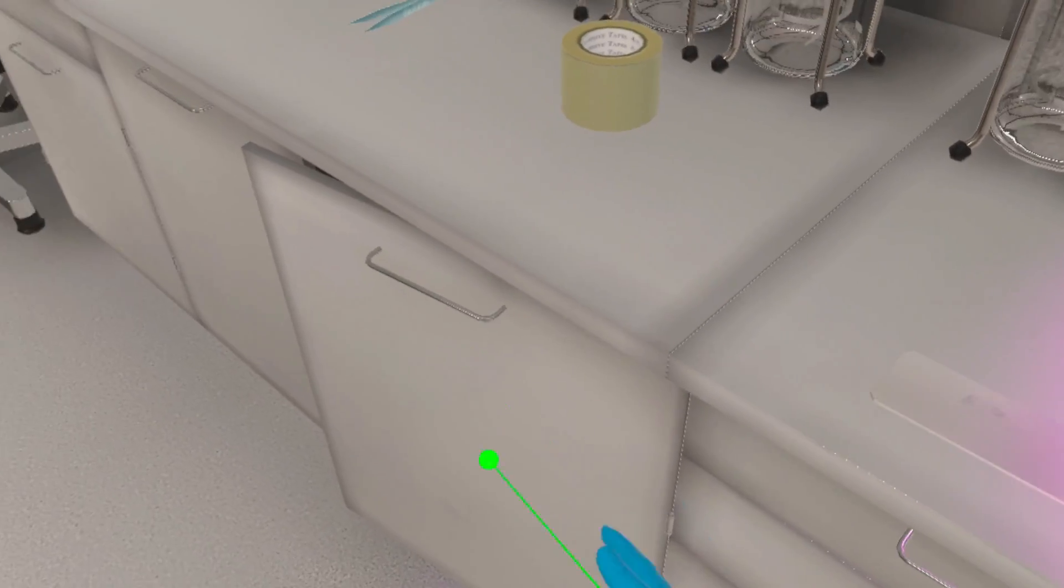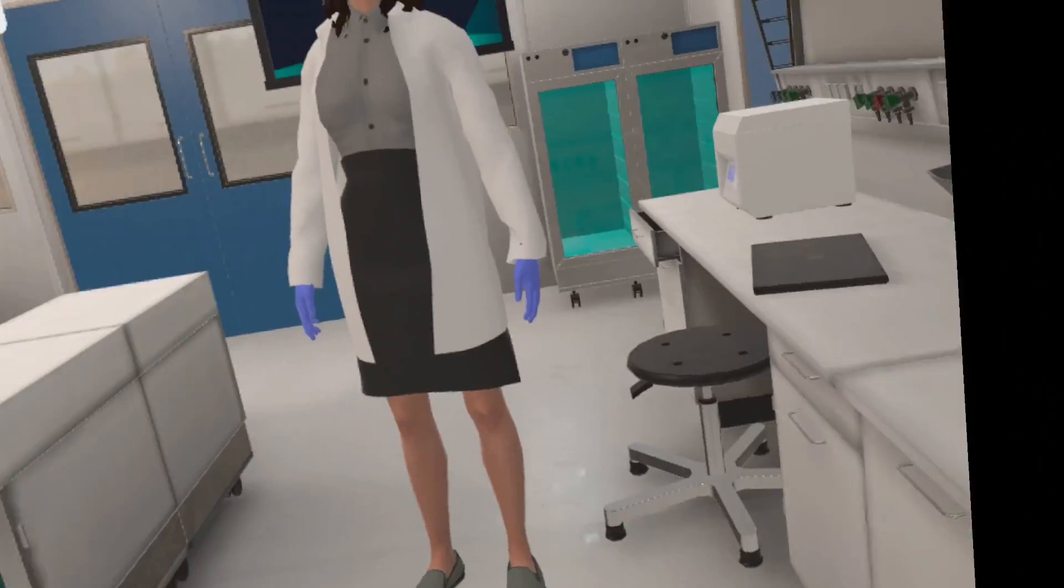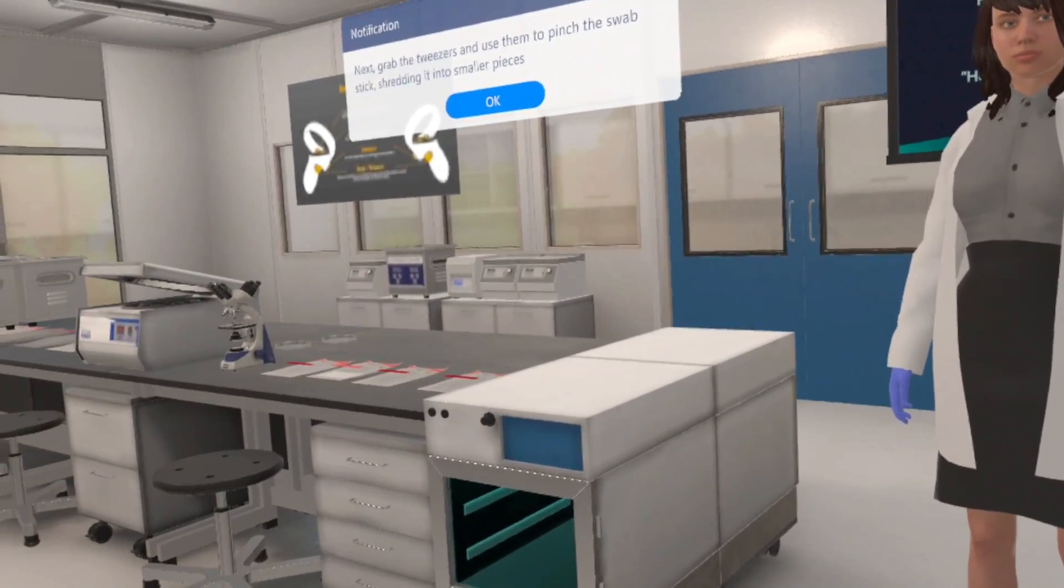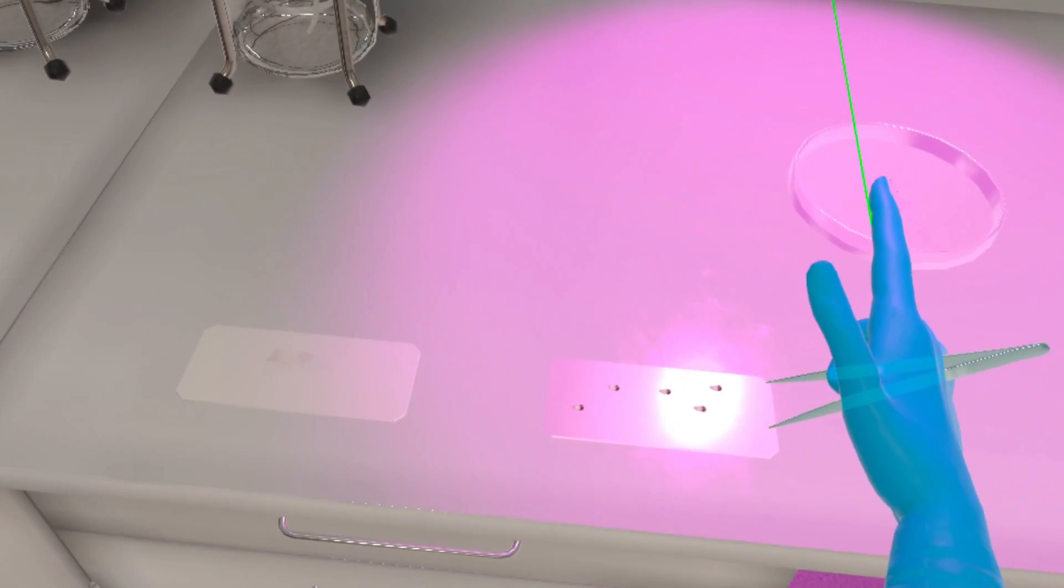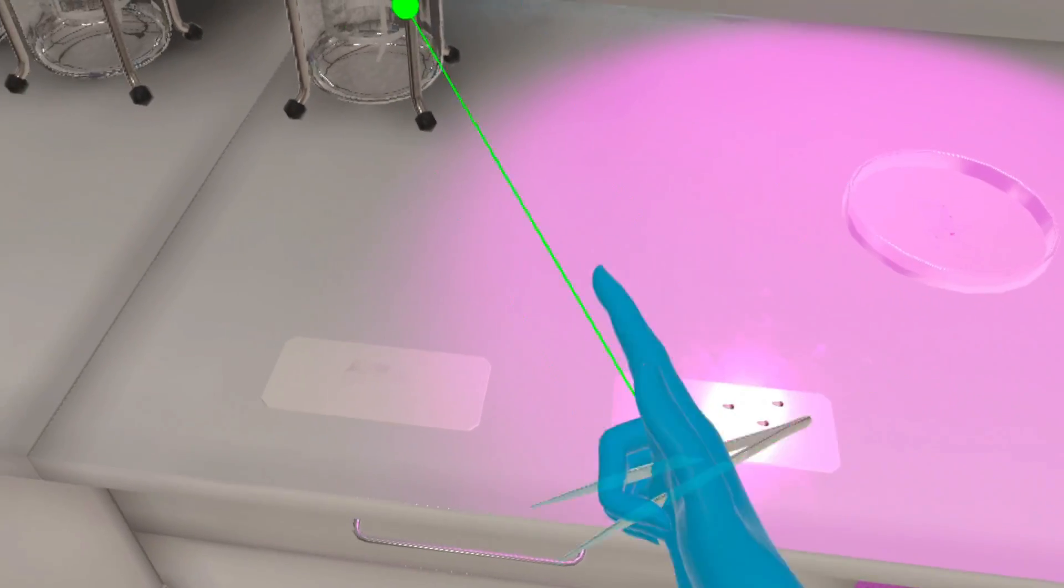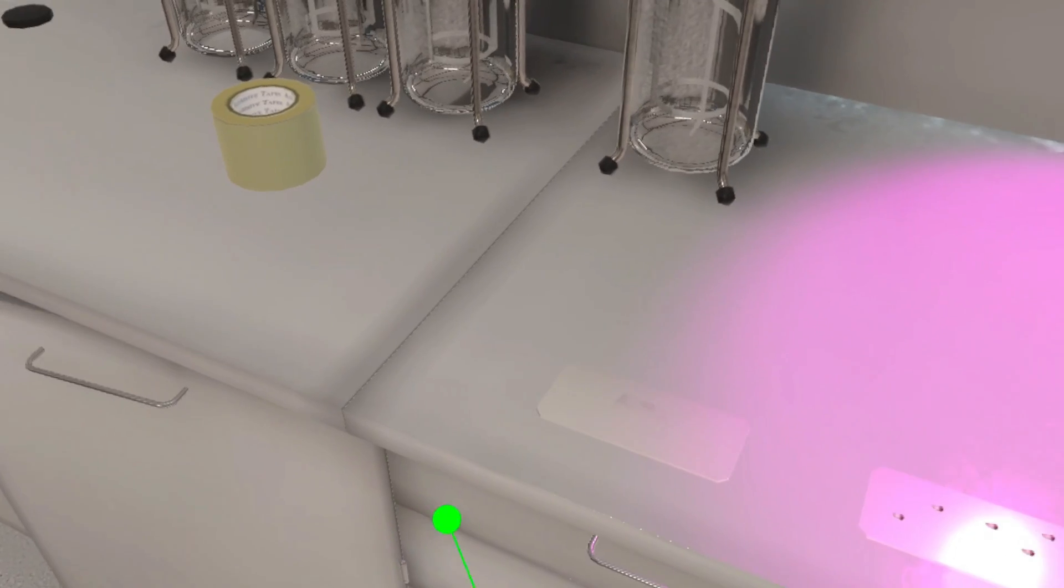Next, grab the tweezers and use them to pinch the swab stick, shredding it into smaller pieces. Let's pick a few of these pieces using the tweezer and move towards the Eppendorf stand.